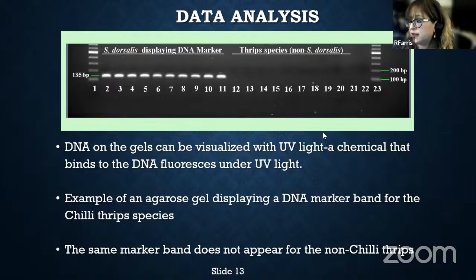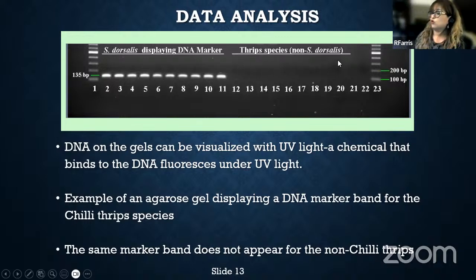If you do not get a PCR product, which we see over here, there was something loaded on each one of these. Just because there's nothing there doesn't mean it just didn't work. We know it worked because these worked. We know here that those were not amplified, and that means that they are negative for chili thrips. So that's one way of analyzing PCR, a very straightforward way. I imagine that possibly for COVID, it was done something similar to this. However, I don't believe they were using conventional. They were using real time, and I'm going to get into that right now.